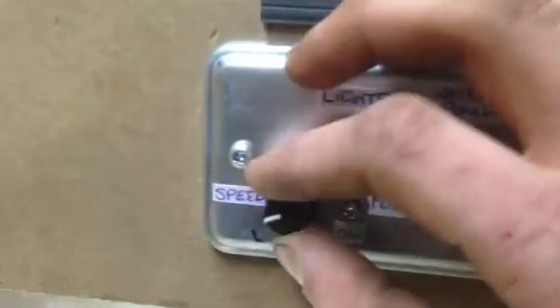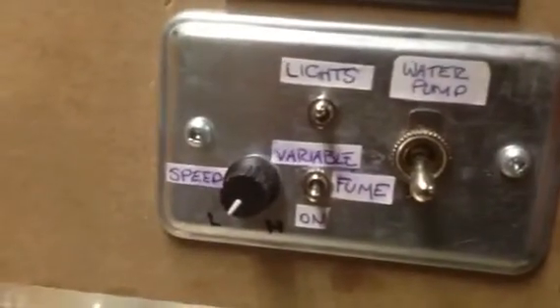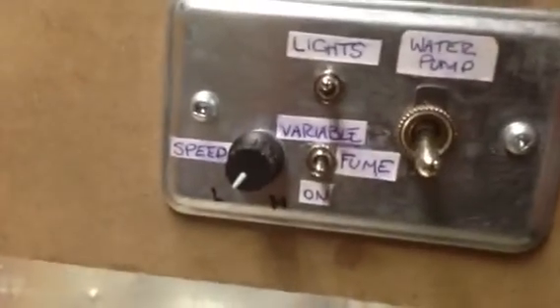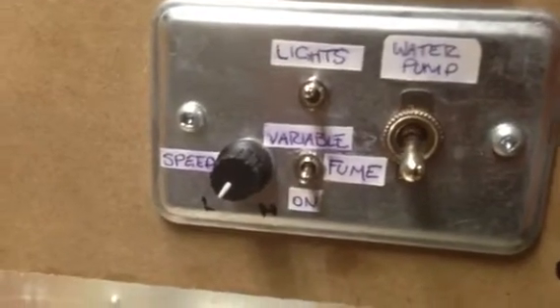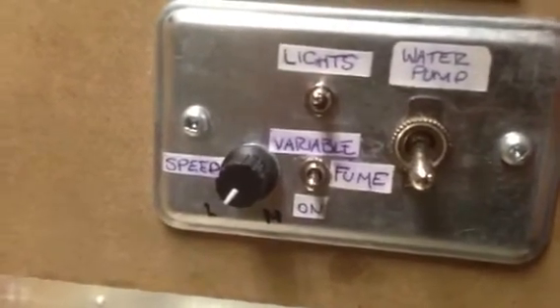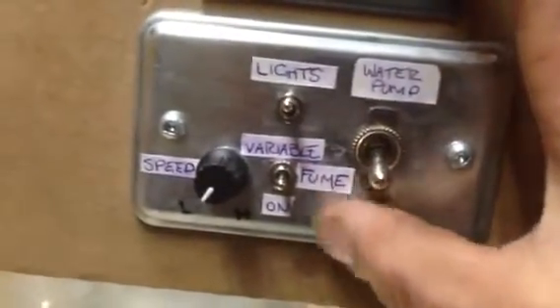There's a potentiometer in there — that's what the dial is on the front. I cut the potentiometer out, cut the power-in line and the power-out line, and basically just wired that all up. I replaced the three-way switch with my own: center is off, down is full on, and up is variable, controlled by the little speed knob here.